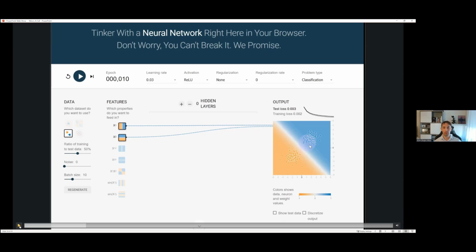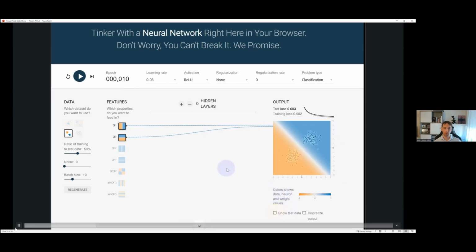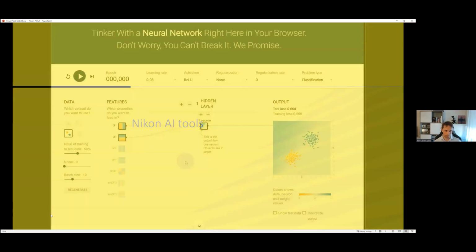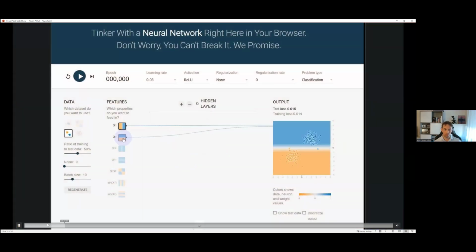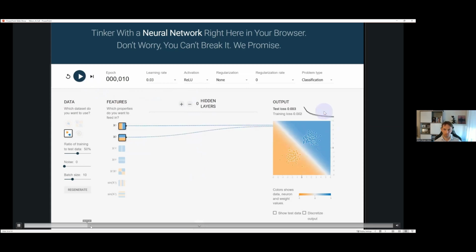So it's another thing. Sometimes the problem is very simple actually, and people still use machine learning because it's just trendy now. And we solved our problem now. Now we can go to another data set. And this one we cannot solve with just a linear fit.